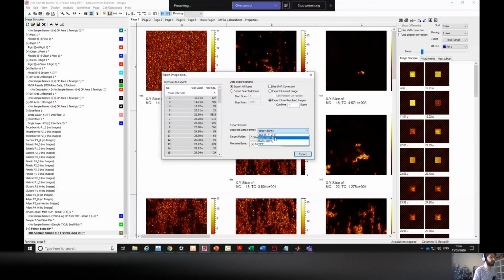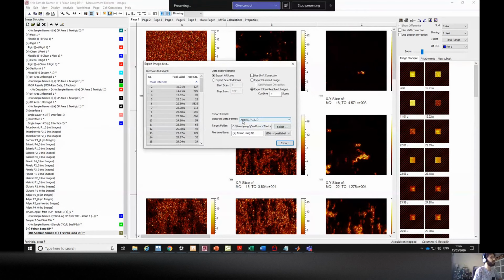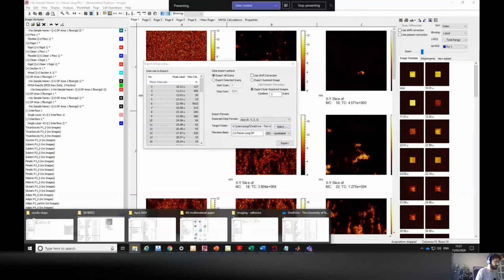So if you have the same bug, maybe we should all use the ASCII for the 3D, unless you exclude the first few levels after you load. Again, I will not do it now, but let me show you what it looks like.